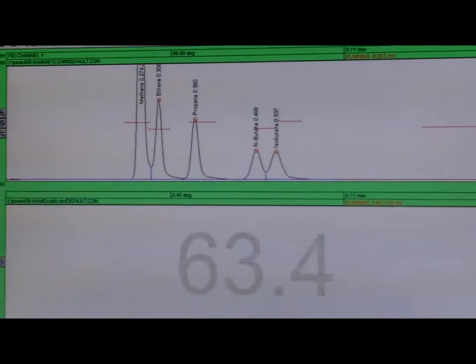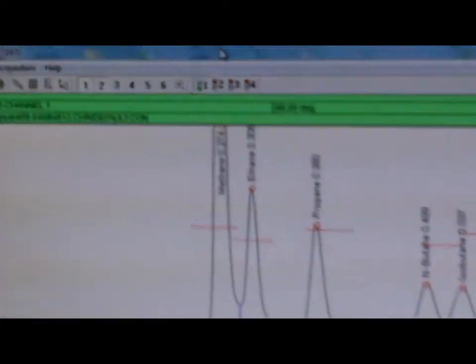The gas sampling valve takes samples at user set intervals down to one per minute and runs them through the column and second FID for percentage levels of C1 through C6.